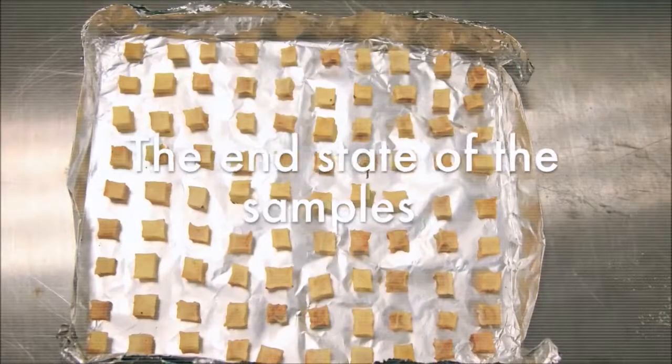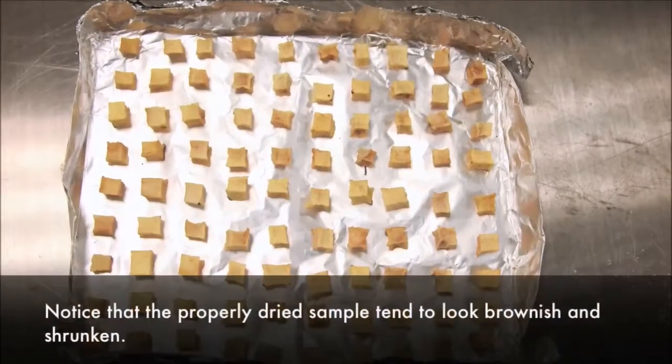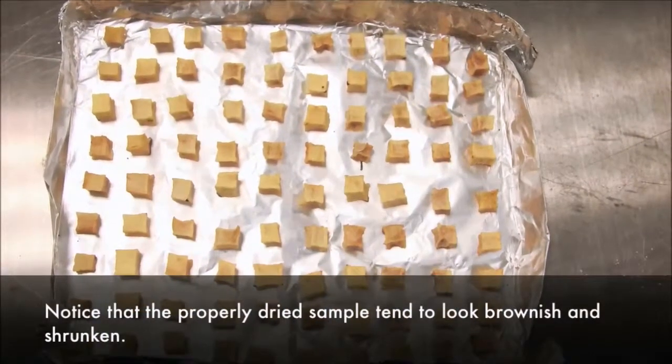The end state of the samples. Notice that a properly dried sample tends to look brownish and shrunken.